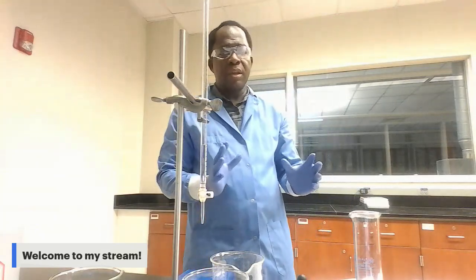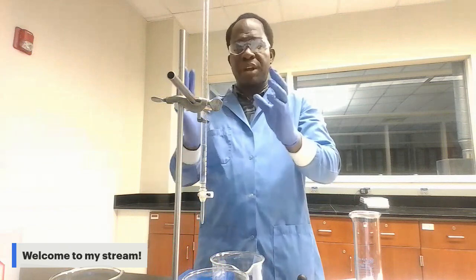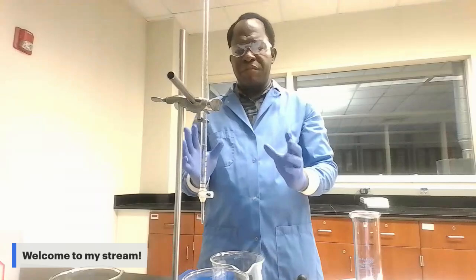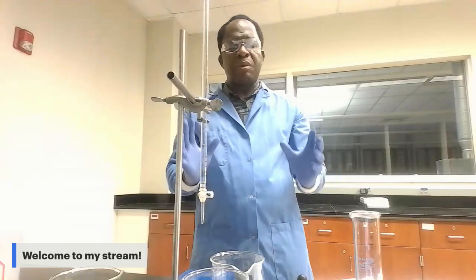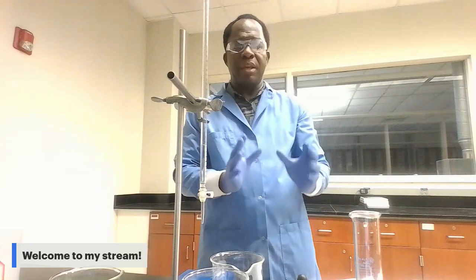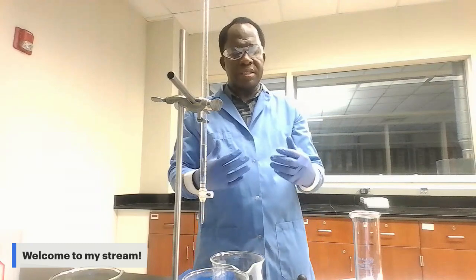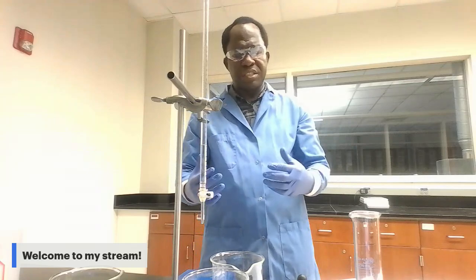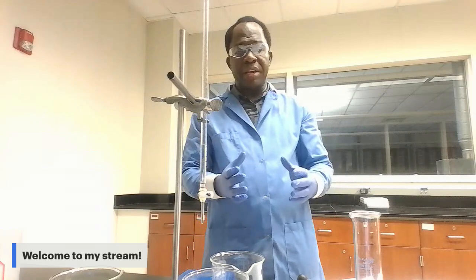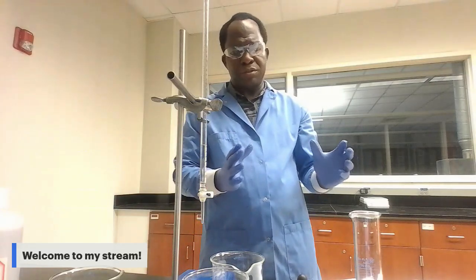Okay, this is a titration. You're going to do the same thing when you come to lab for this titration process. Probably you might have a volume slightly different from the one I'm getting, depending on how accurate each one is in this lab. You shouldn't be too far from the volume I'm getting. You don't have to question your answer if you are not too far, you should be good.